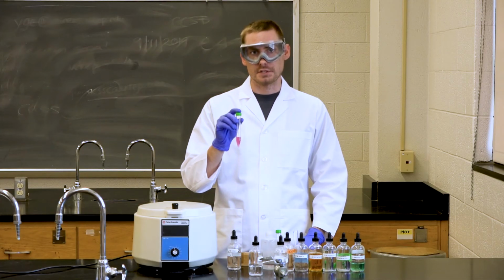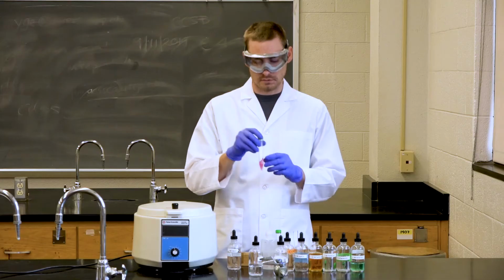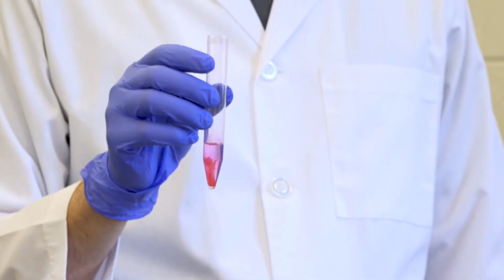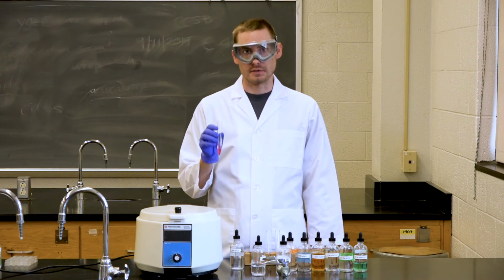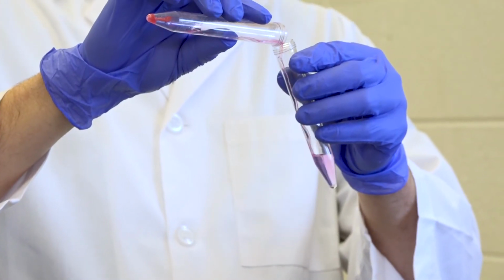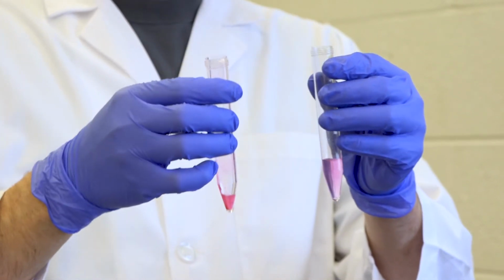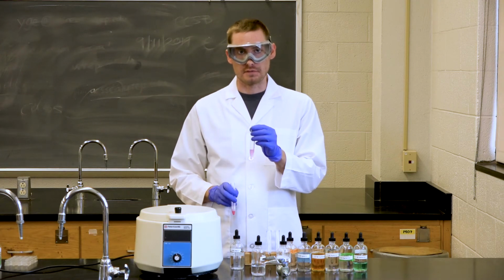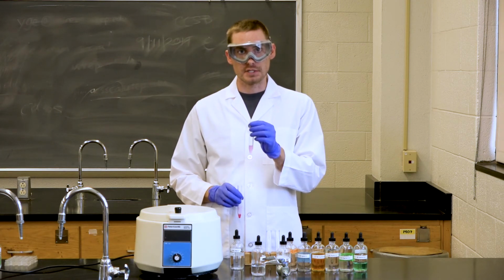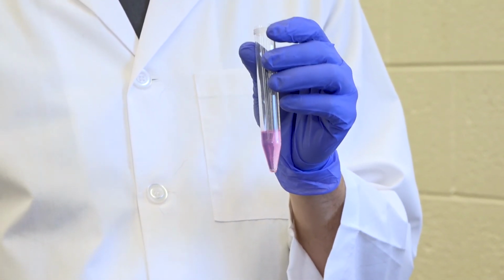So now we will centrifuge this one again and then separate the solid from the liquid. This test tube only has 2 ions left in it, and we know one of them is nickel. So now that we have finished centrifuging test tube D, we can pour off the liquid into a fresh test tube. You may have a slight pink hue to the final test tube. You can centrifuge this again to remove it, but for now we're going to continue. It's not going to affect our final analysis.